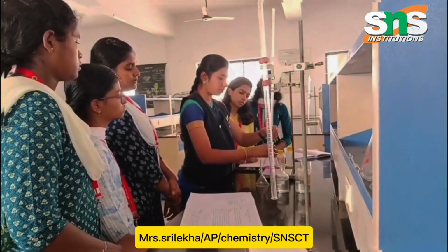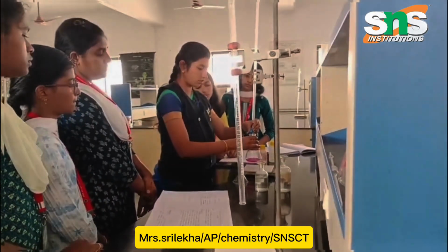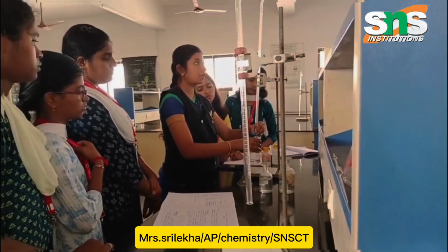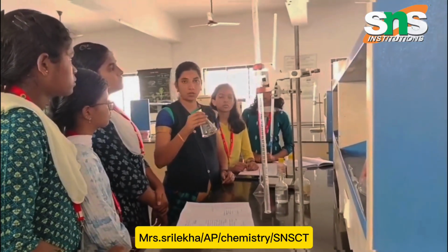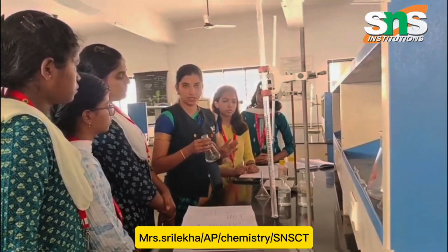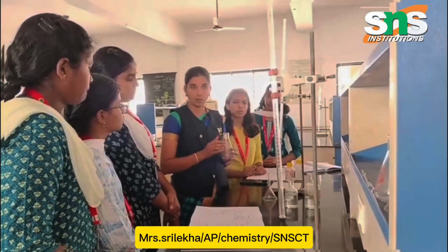While titrating drop by drop, we have to set the burette solution. With this strong concentration of the HCl solution, it gives the value of 1 ml of the solution. The concentration of HCl may change, whether 0.2 or 0.3, and the readings vary approximately from 10 or 11 to 12.